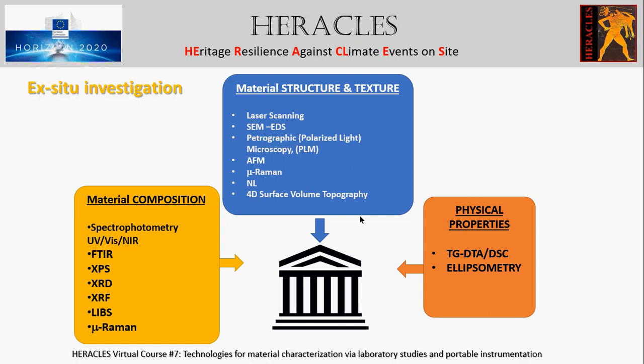The petrographic microscopy represents an important tool for a detailed analysis of minerals by optical mineralogy in thin section, since the microtexture and structure are critical to understanding the origin of the rock or stone under study. The mineral content and the textural appearance can be evaluated.